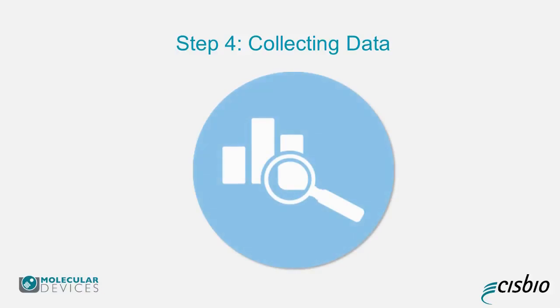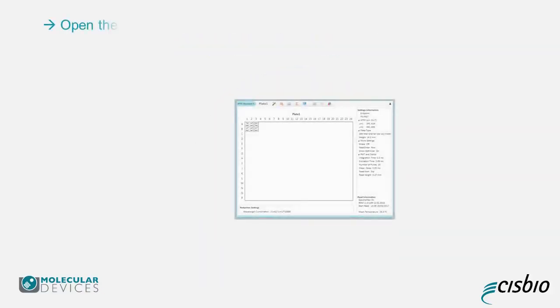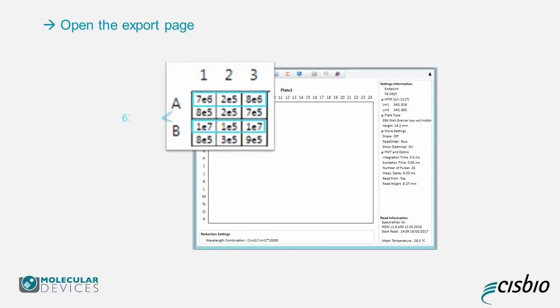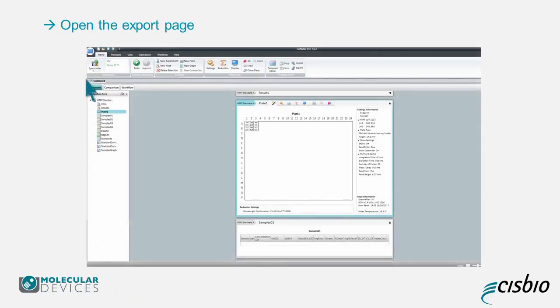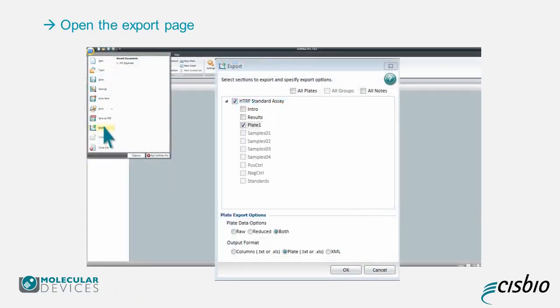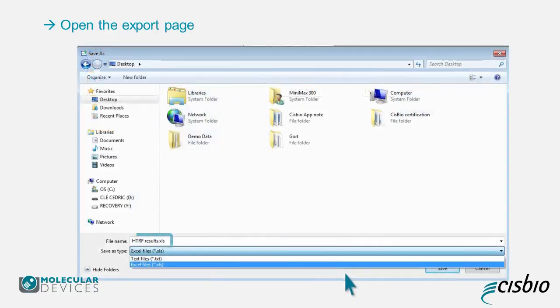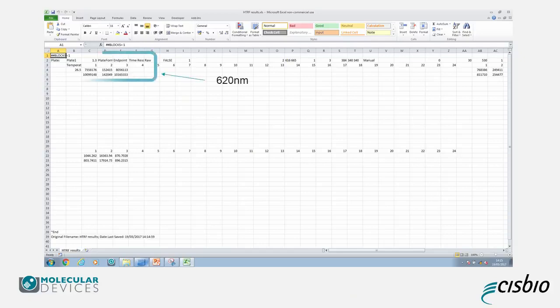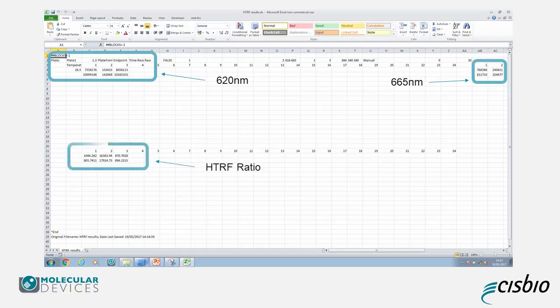Step 4: Collecting Data. Once the plate reading has finished, the data will be presented. The top reading in each square represents the 620 nanometer values and the bottom reading equals the 665 nanometer values. To export your data, click on the microplate icon in the top left, then click on Export. On the new screen, click on Plate 1, then Both, and choose your preferred output format. In the Save As screen, name your file and save it as an Excel file. In the Excel file, the upper left part contains the 620 nanometers, the upper right the 665, and the lower part gives the HTRF ratio.